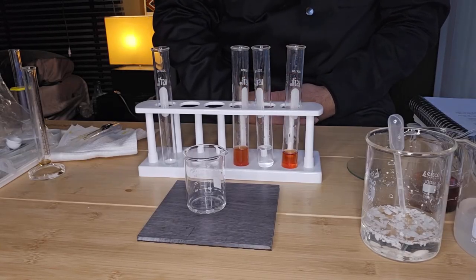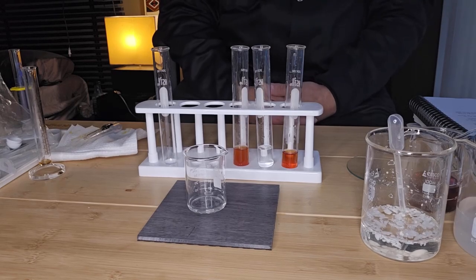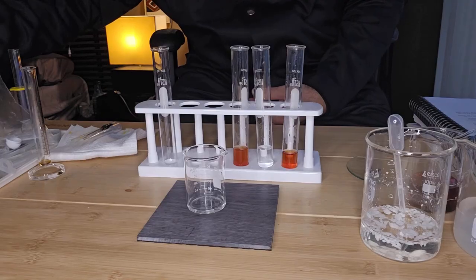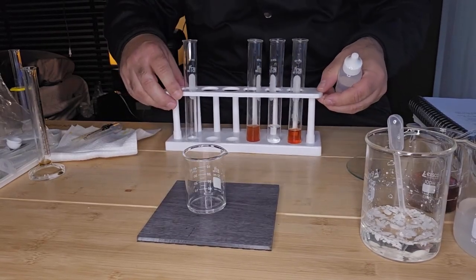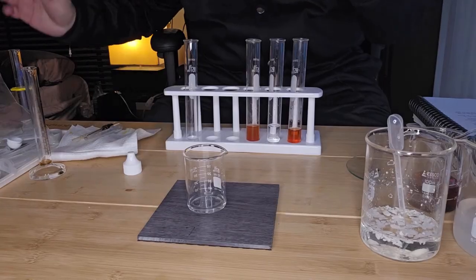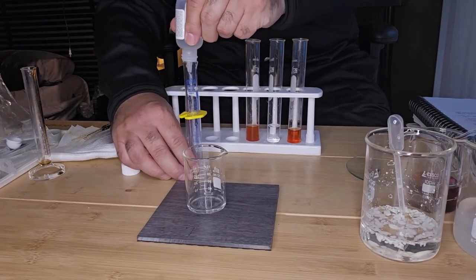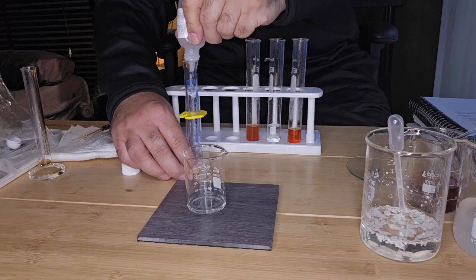And what I'm going to do is add 10 mLs of ethyl alcohol or ethanol. Okay, so I've got my alcohol here, and I'm going to measure 10 mLs. I've got a clean measuring cylinder. So I want to add 10 mLs.